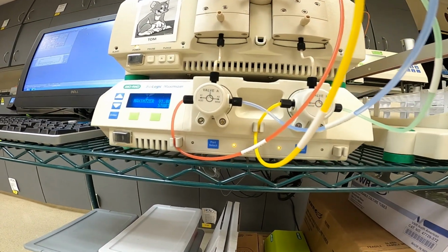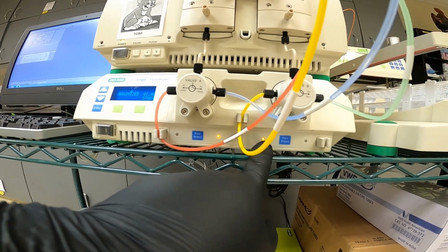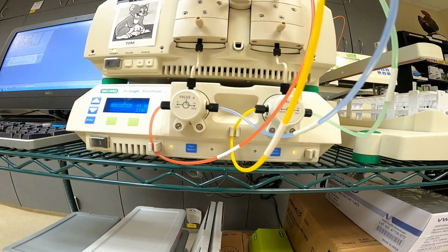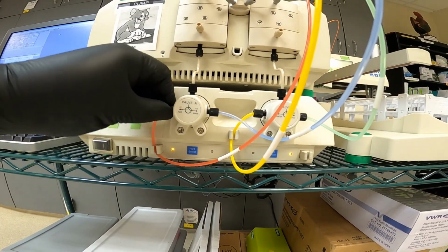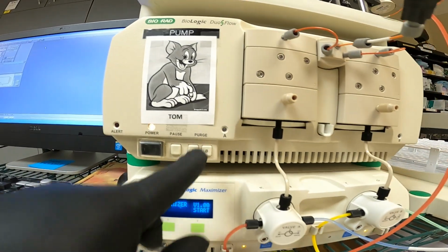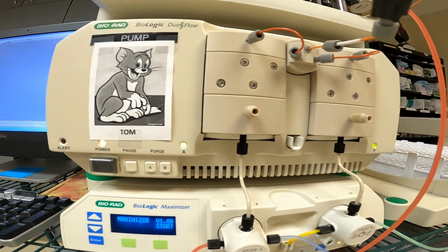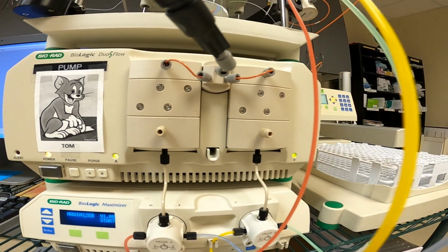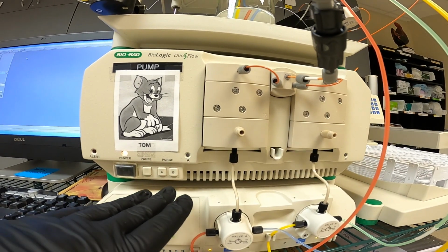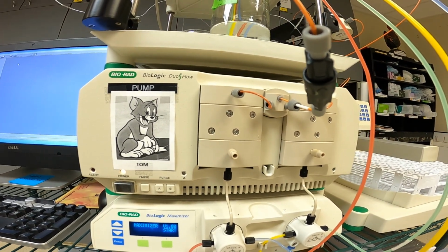So here we can see that currently A2 and B1 are activated, so we'll push the port select buttons. That will activate the other 2 ports that we have not purged yet, A1 and B2. And then we'll go to the pumps here, and you can press these buttons, and you'll see that the pumps are now purging. So once we've purged for 30 seconds, we can push the purge buttons again, and it will stop.